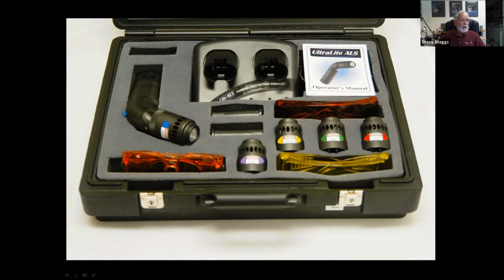Now, this is a kit. Let me just talk about the kit here for a second, and then we'll move on to how it works. This is the lamp itself. It's like a big flashlight. And then these are the different filters that go over the end. You choose the filter to get the kind of light that you need.